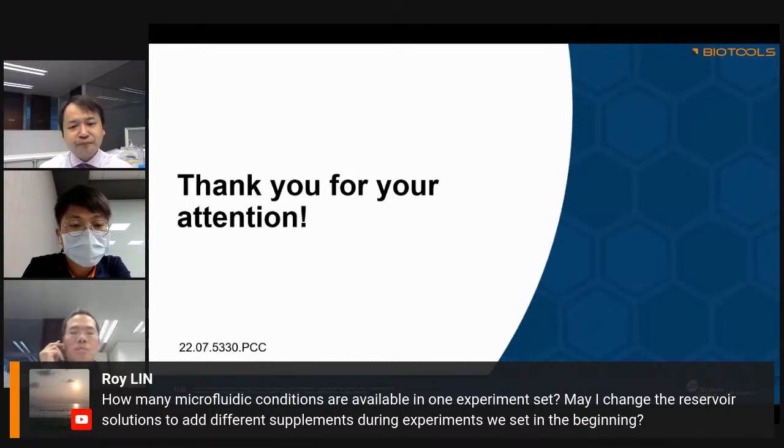But if you talk about the reservoir solutions, in some sense, you want to understand what you are doing. So we already set the supplements or the liquid you're using. It is very seldom that you will change it in the middle.